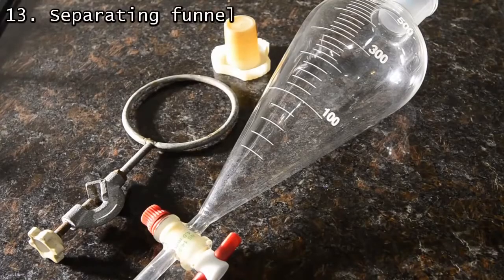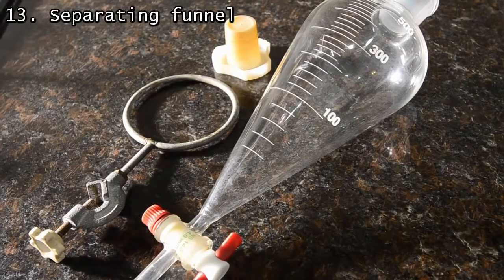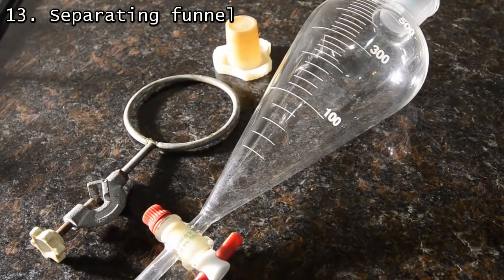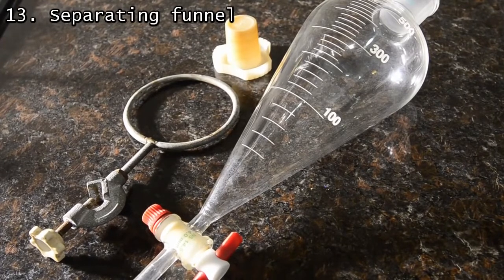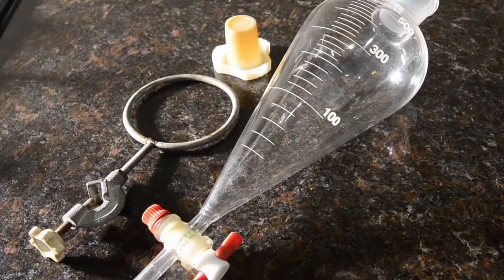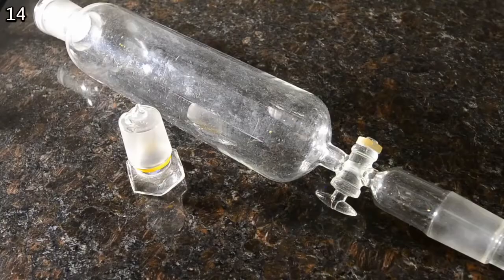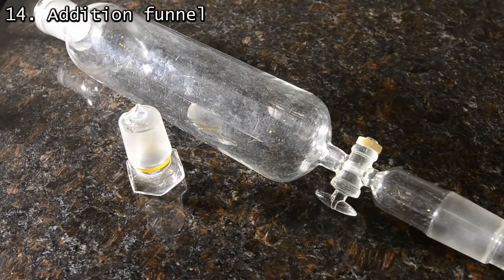A separating funnel is a very useful piece of equipment. We use a 500 ml one for everything. Remember that you also need a good quality stopper — preferably Teflon — and also a ring clamp for it to safely stand in. Just handle with care and take extra care when washing.